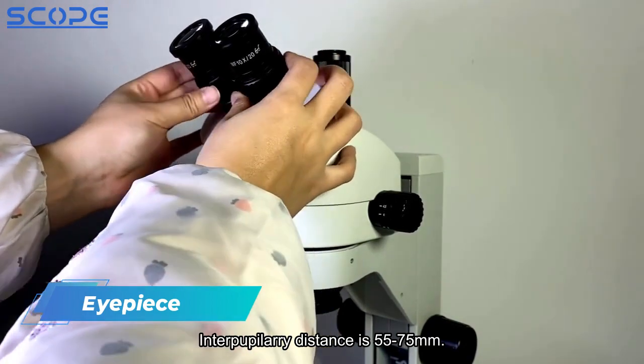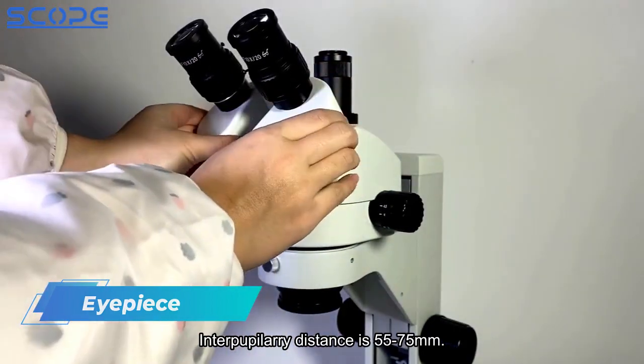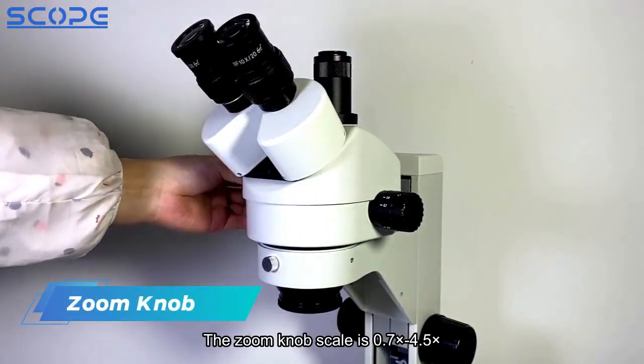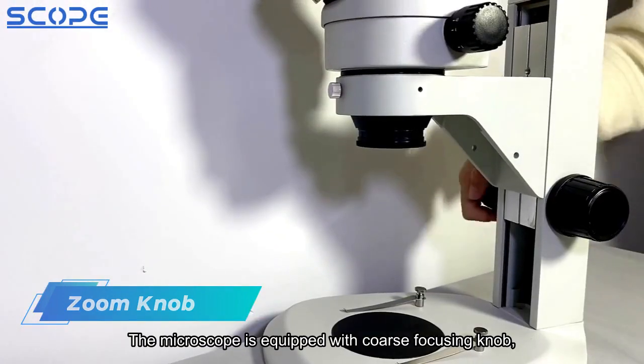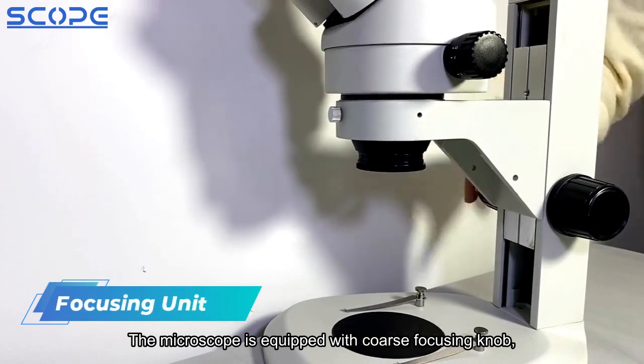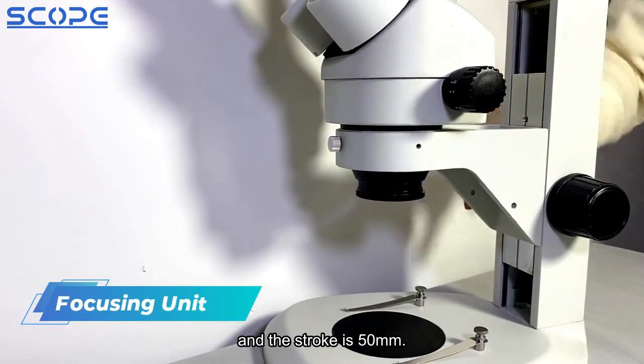Interpupillary distance is 55-75mm. The zoom knob scale is 0.7x to 4.5x. The microscope is equipped with a coarse focusing knob, and the stroke is 50mm.